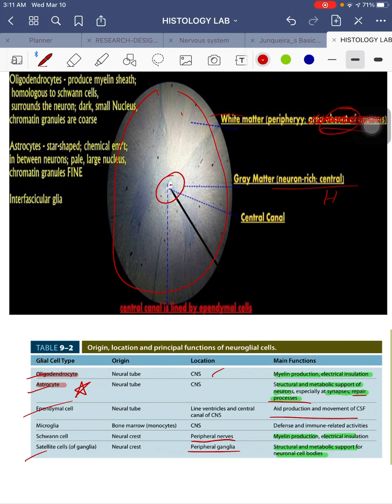Ependymal cells line the central canal of the spinal cord and aid in the production and movement of CSF. Schwann cells will be portrayed later particularly in the nerve sections of your sciatic nerve — they are found in peripheral nerves and function for myelin production and electrical insulation. Satellite cells are found in peripheral ganglia and function for structural and metabolic support for neuronal cell bodies.